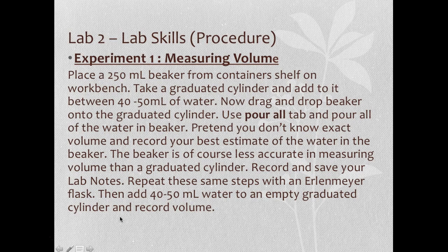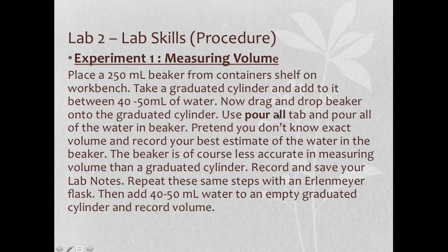The first experiment involves measuring volumes. You'll take a beaker from the container shelf, place it on your workbench, then fill a graduated cylinder to approximately 40–50 mL of water. Next, drag and drop the beaker onto the graduated cylinder — a dialog box will appear — then click 'Pour All' to transfer all the water from the cylinder into the beaker.